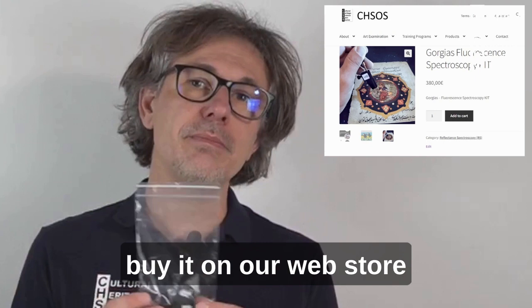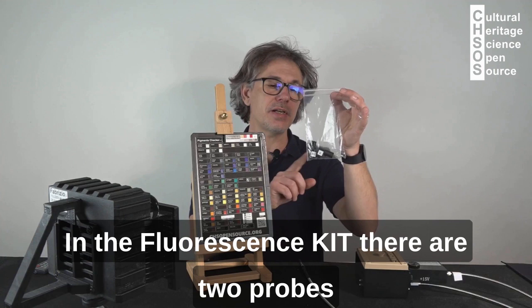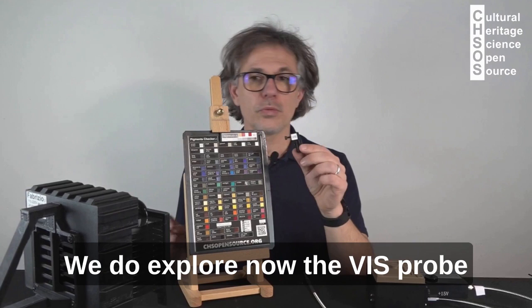If you already purchased Gorgias, you can buy it on our web store. In the fluorescence kit there are two probes: one probe is labeled Vis and the other probe is labeled IR, infrared.